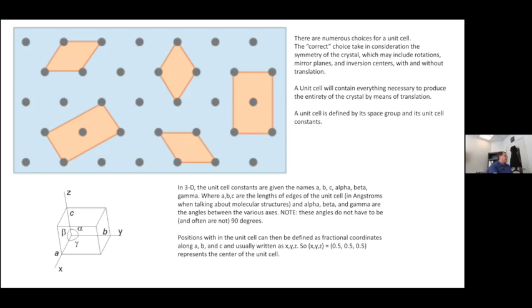Okay. And there's an important thing to note here, which is that these angles do not have to be, and often are not, 90 degrees. So in common everyday life, when we think about grids, we usually think about an XYZ plane or XYZ grid with orthogonal axes. So all the angles between the axes are 90 degrees. That's great because it simplifies math when you deal with moving things around. But in the world of crystallography, we don't always deal with 90-degree angles.